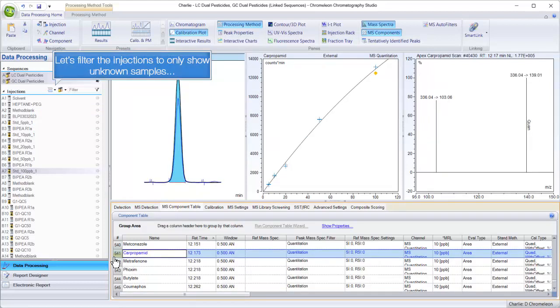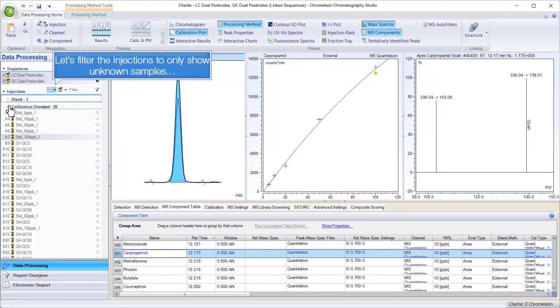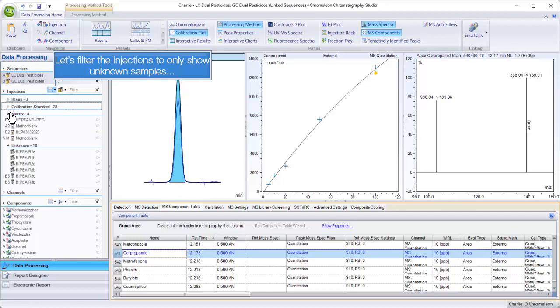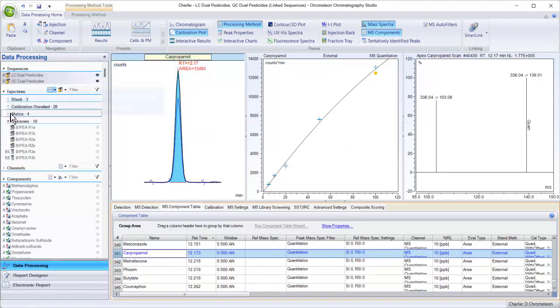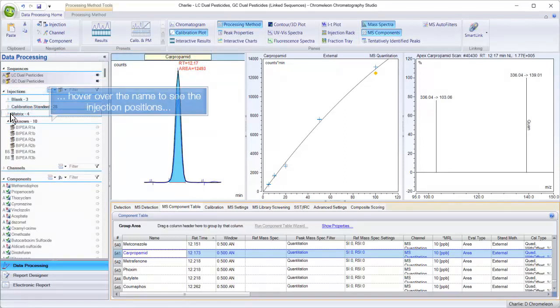Let's filter the injections to only show unknown samples. Samples in both sequences do not have an identifier, but hover over the name to see the injection positions.